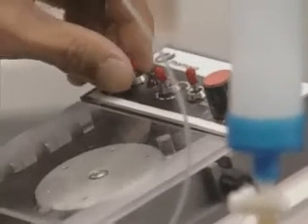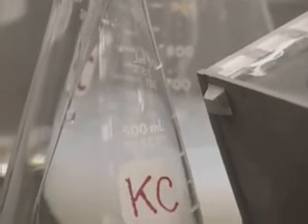Then buffer is set to run continuously through the column, added at the top and collected at the bottom.